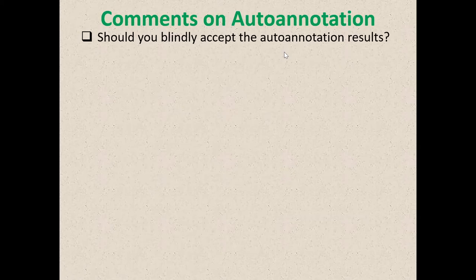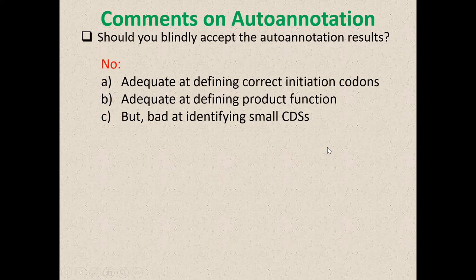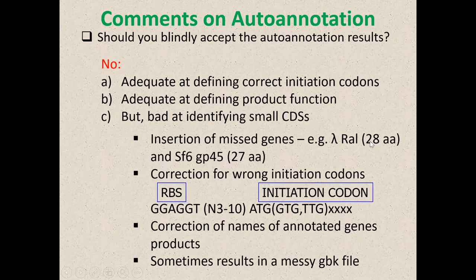Should you blindly accept auto annotation results? No. The programs are only adequate in defining the correct initiation codons and product function, and they're bad at identifying small coding sequences because they're trained for bacterial genomes, not phage genomes. Phage genomes frequently have very small coding frames. Examples include Lambda RAL, Lambda Nin, and SF6 — around 75 nucleotides. You need to correct wrong initiation codons.